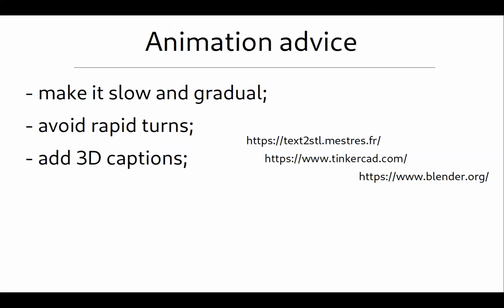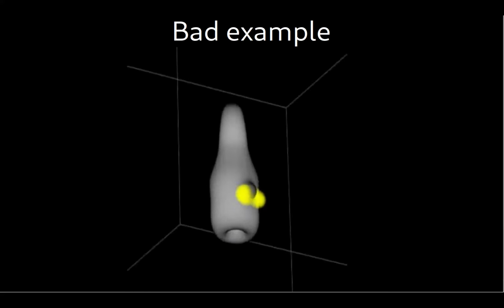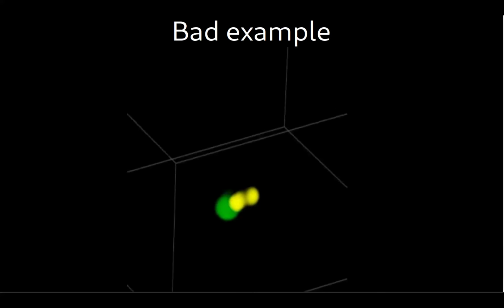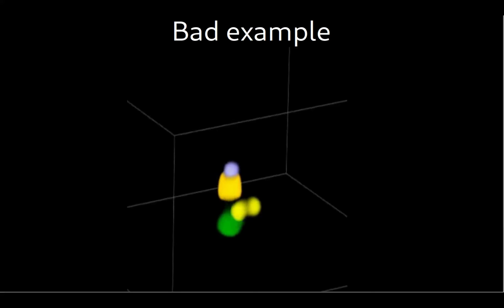And just to give you an example of a bad movie, this is the movie that I made with the data that we have. This is the so-called puzzle body, where we want to show different proteins in 3D, where we did mapping. There are a lot of things, it's not very clear what's going on, everything jumps.